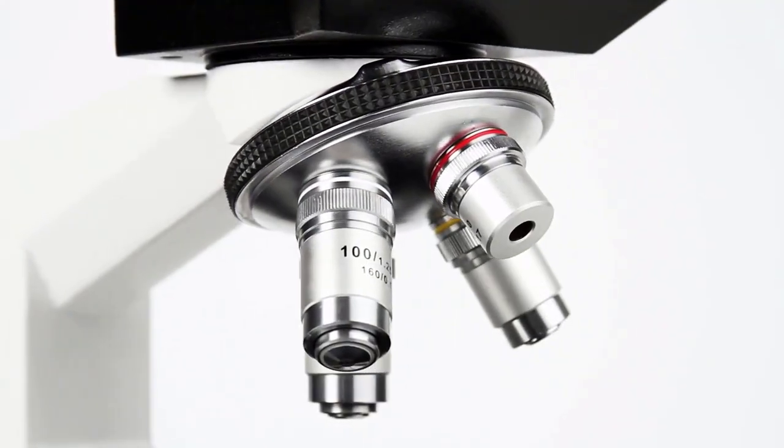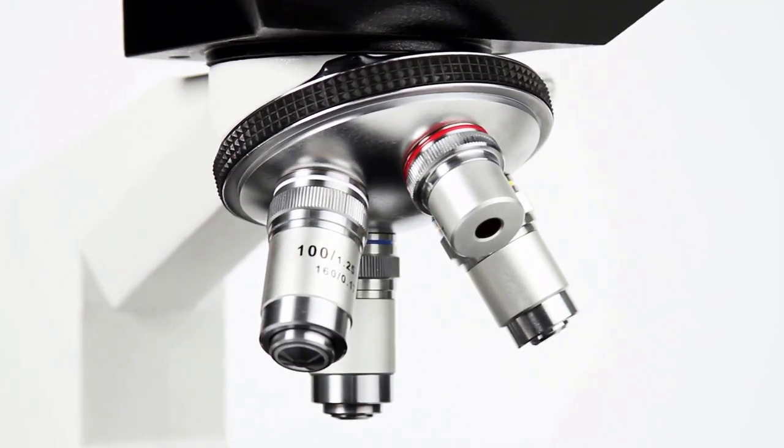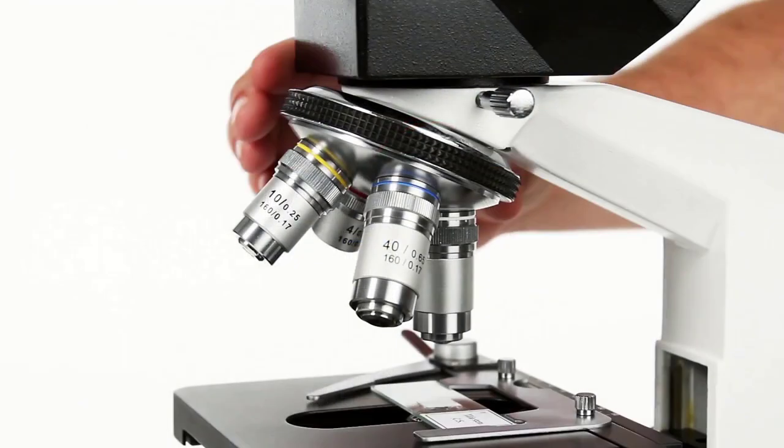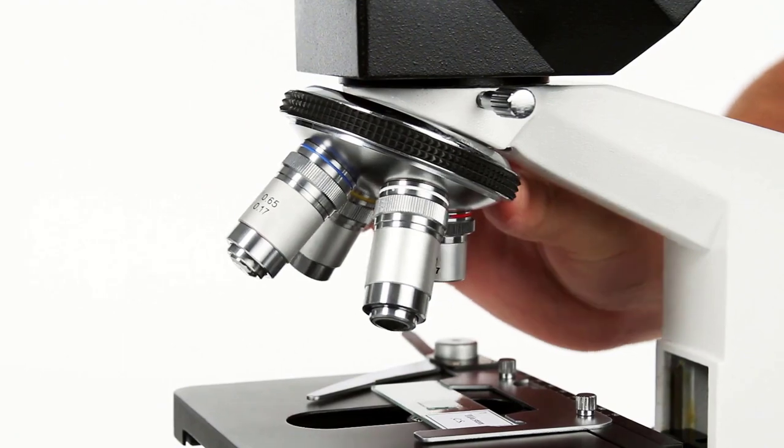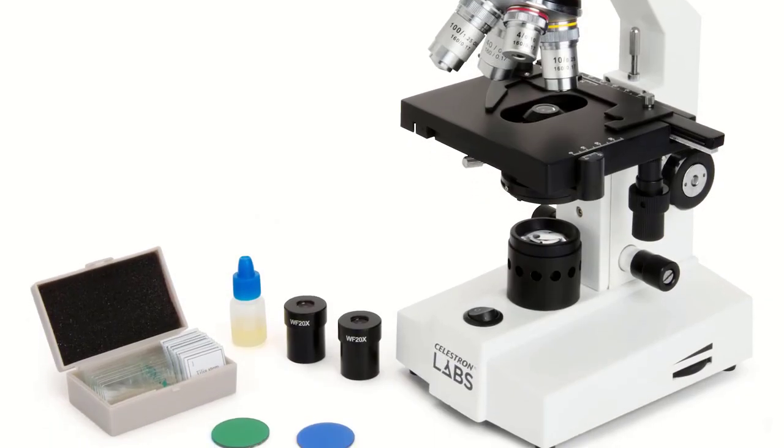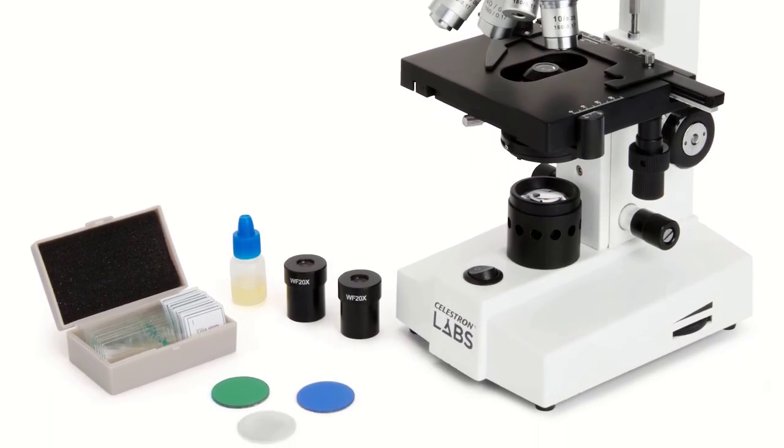The combination of two eyepieces and three objective lenses allow for magnified observation at 40x, 80x, 100x, 200x, 400x and even a whopping 800x, and the built-in LED illumination is adjustable.